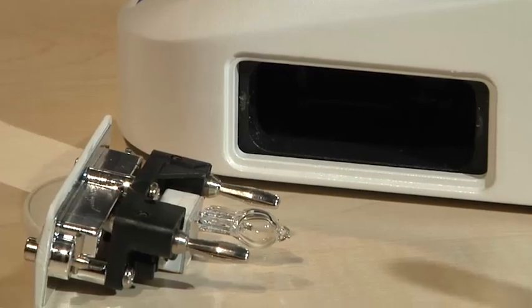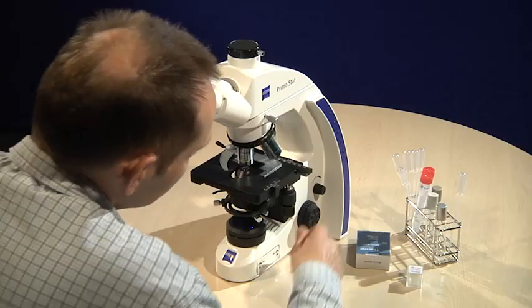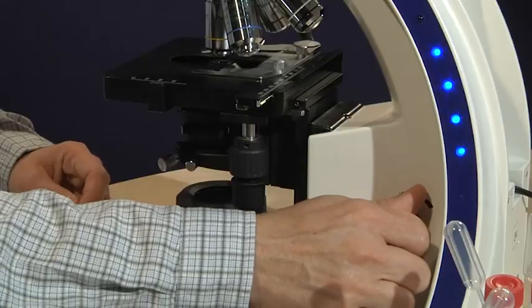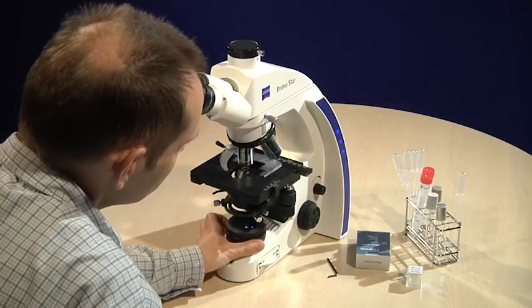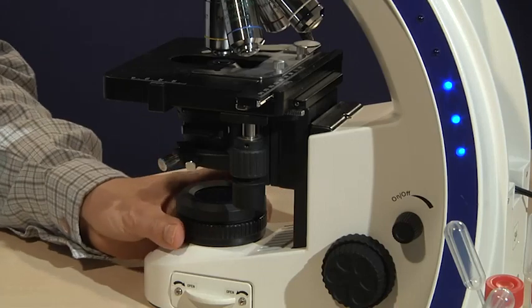The light source is an adjustable halogen lamp. The adjustable luminous field diaphragm is placed just above the lamp.